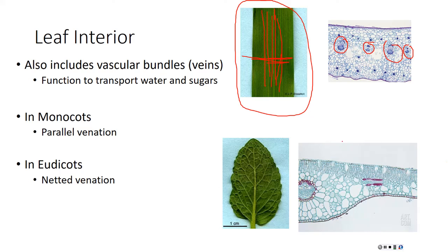That's pretty typical. So you want to pick out the xylem and the phloem and the mesophyll, as well as stomata if visible in your drawing. And I know that I've just given you the image, so you don't have much to pick from. You can't sort of zoom around, so just draw what you can.